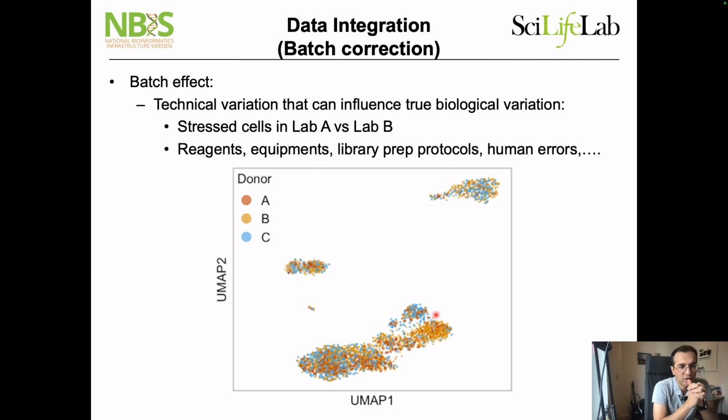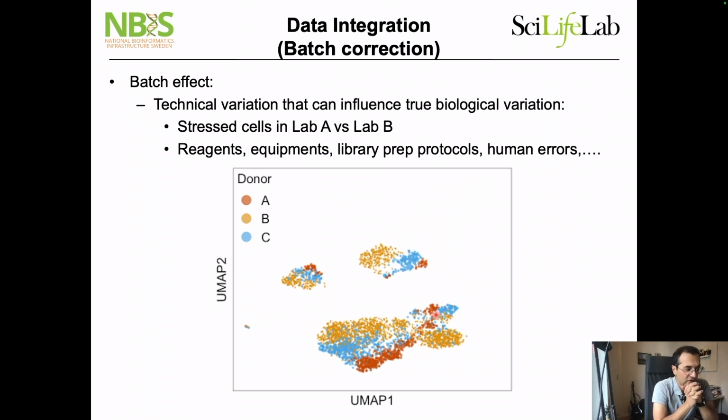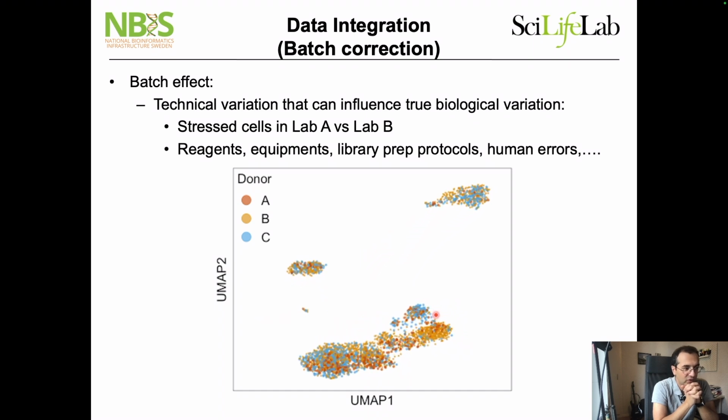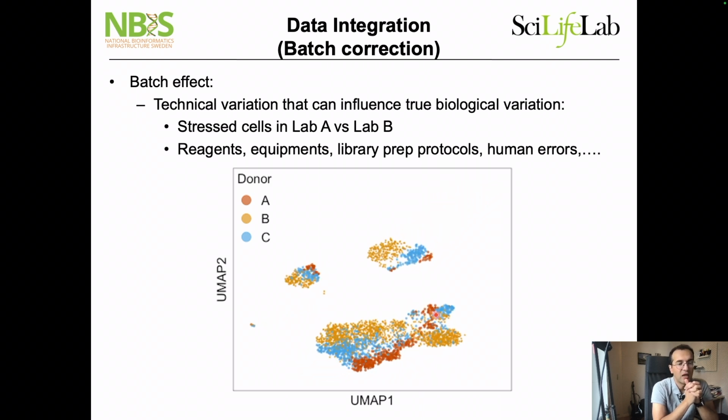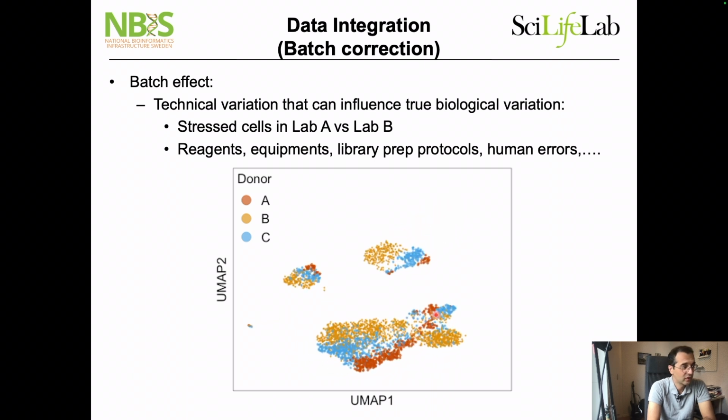So there is one question: how to make sure not to overcorrect? Any criteria? In single-cell RNA-seq, you have to go a lot of times forth and back. Sometimes, for example, you have a gene of interest which has a given expression profile, and if you filter those cells, those genes, you may not see the effect in your experiment. That's one example that I can give you in terms of overcorrection.